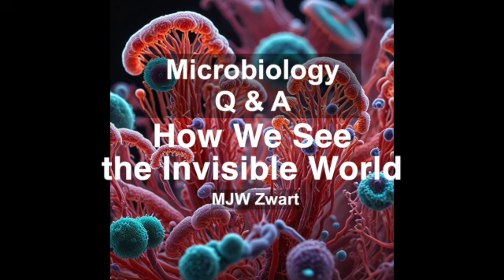It's not just about bending light. No, it's not just bending light. It's called refraction, by the way. Refraction. Right. But microscopes also use other properties of light, like reflection and absorption, to create contrast. So we can see the tiny structures? Precisely. So light does all the heavy lifting.